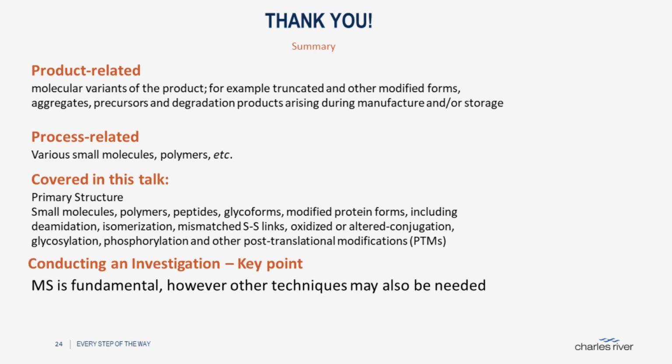One thing that we look at quite often is we do have whole databases that we use internally, but all of the vendor software that comes with mass spectrometers will have the option to add these PTMs to your sequences. But if you need resources that are online, one of them is ABRF Delta Mass. I've been using it so long I forget even. Apologies, ABRF. That's one place to check, but there are definitely various resources online.